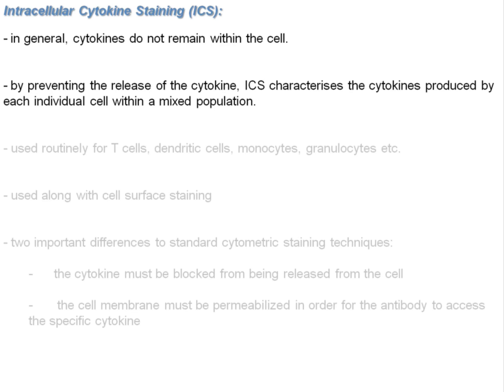We can use this with most, if not all, immune cells of use. In particular, it's used a lot with T cells, also monocytes, macrophages, dendritic cells, granulocytes. And I'd imagine, as far as I know, most cells that are producing cytokines are amenable to intracellular cytokine staining.